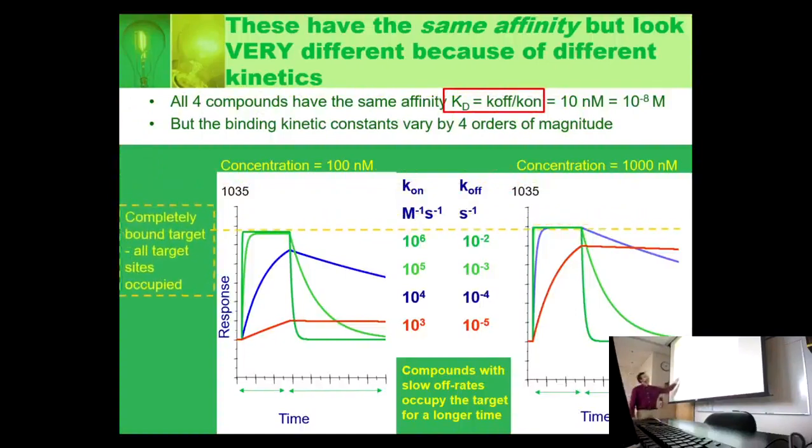The other thing is that you see that they go up to a maximum. The maximum has value for saying what's the most we can bind to the surface. And the maximum for these two is pretty close to the same, although reaching that maximum can be slower in the slow on case. It takes you longer to reach the maximum. So we'll be working on this as we go through.